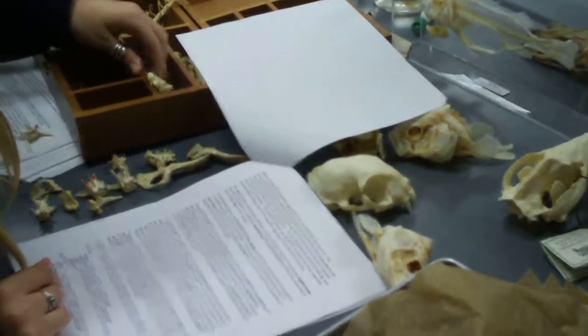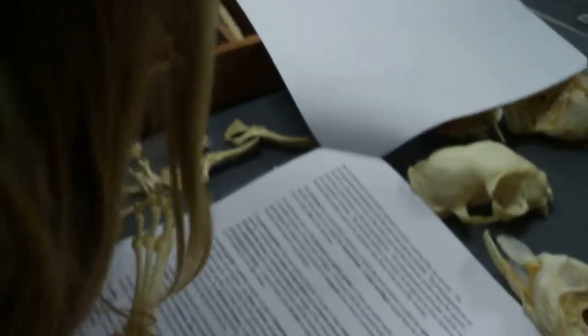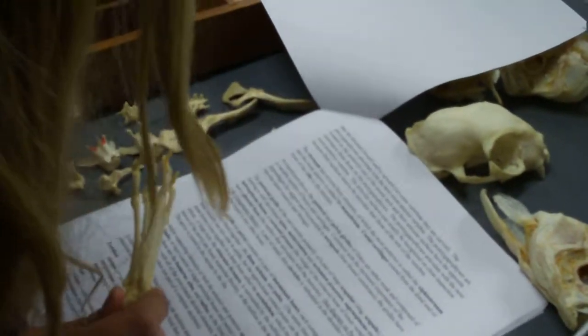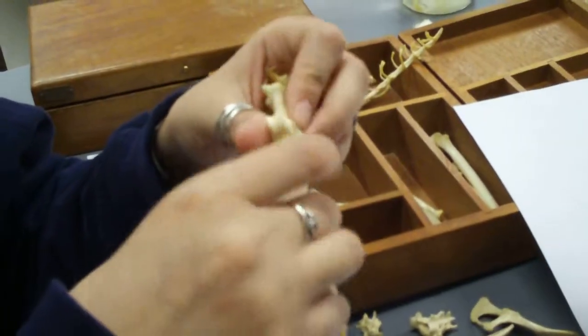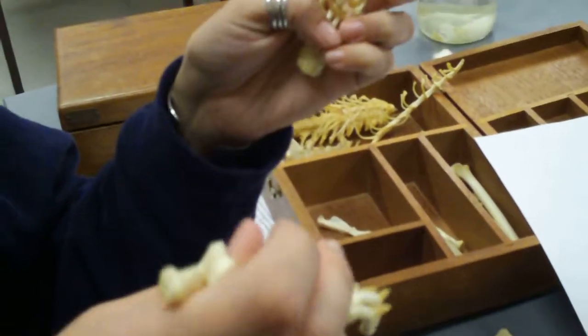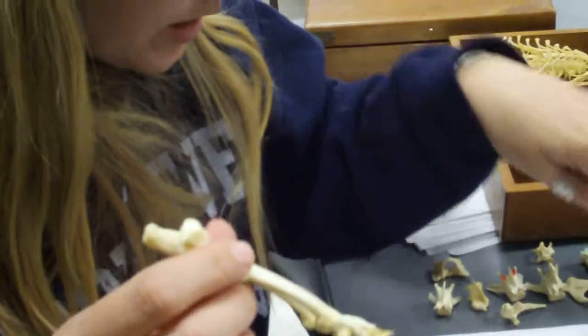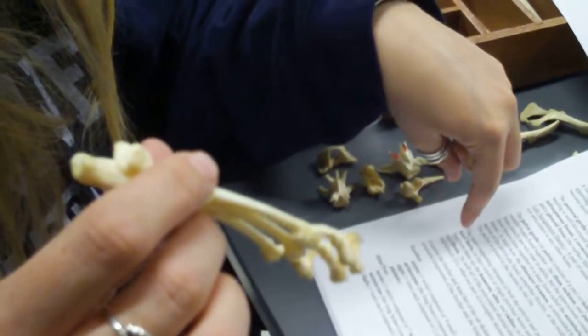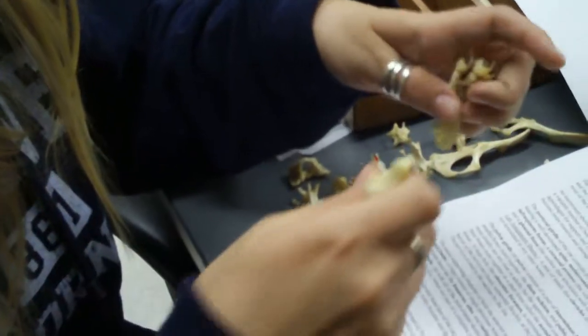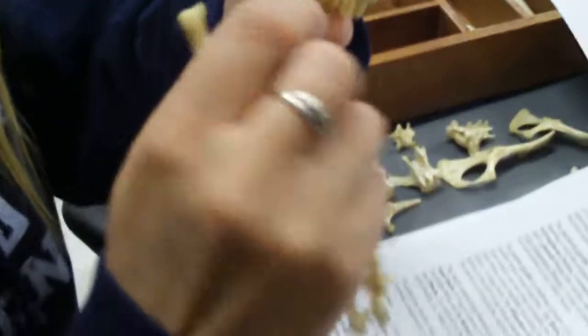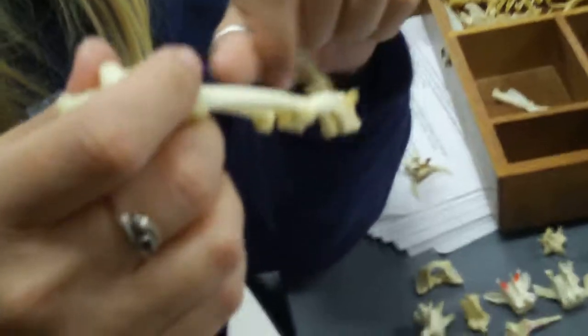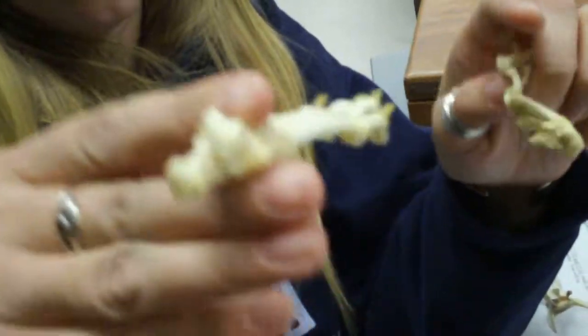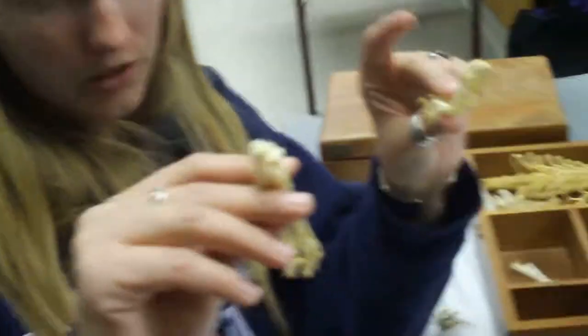Appendages. Know the difference between a hindlimb and a forelimb. The hindlimb, you have much longer tarsuses on. Tarsus? Wouldn't it be? Yeah, something like that. And your metacarpals. So, they're carpals right here. Metacarpals. These would be your metatarsals and your tarsals. So, much longer on the hindfoot than the front foot. Know the difference between them.